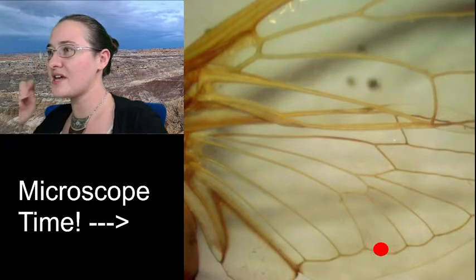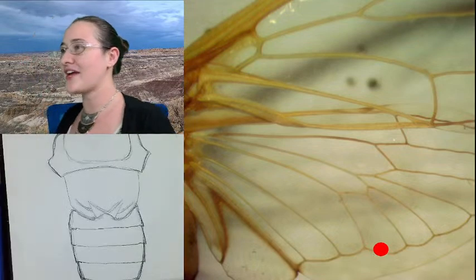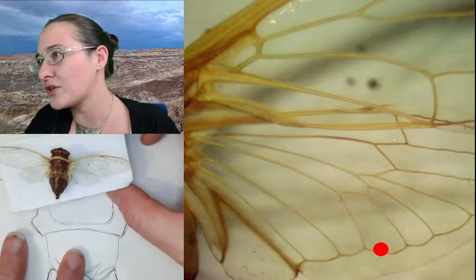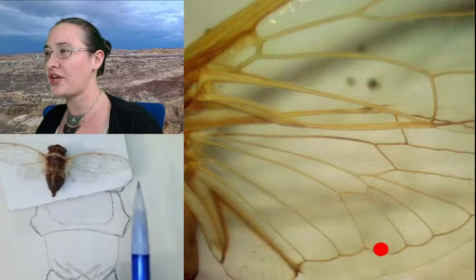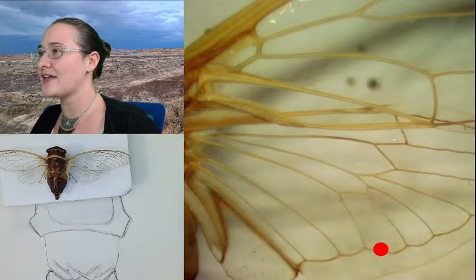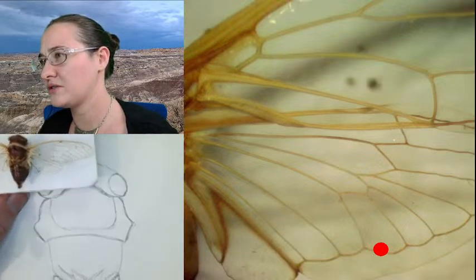All right, so this is the base of the wings. This is as far out as I am able to zoom my microscope, but I can also pull the specimen over while we're looking at it. So for one, we can look over here, just to see the body shape, the wing shape, and then look at the wing venation. That might work.